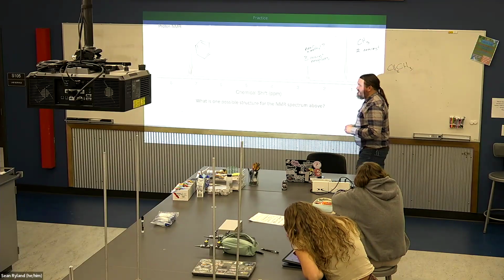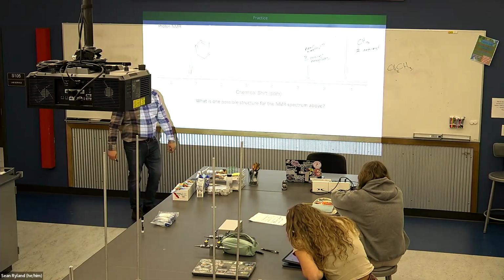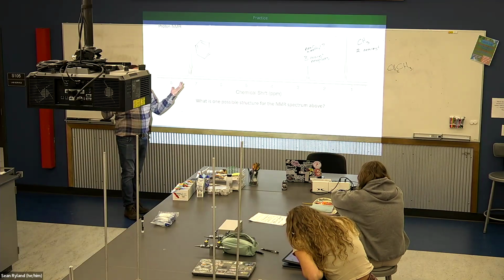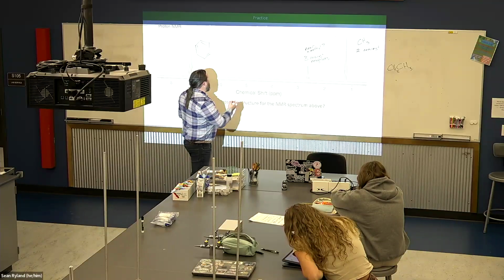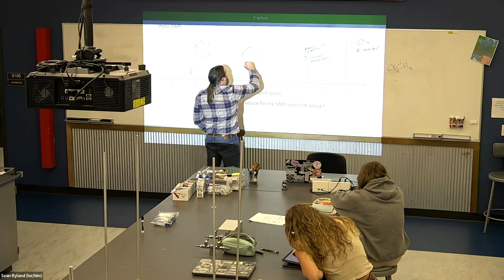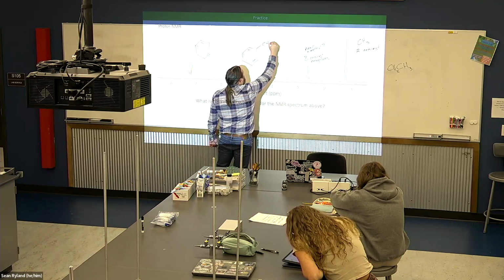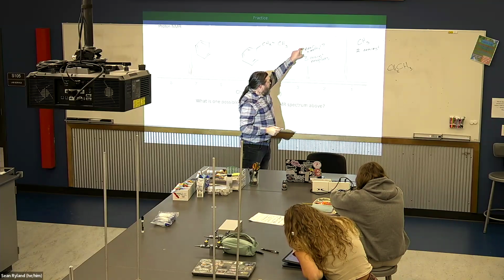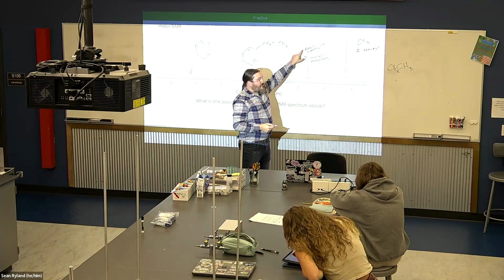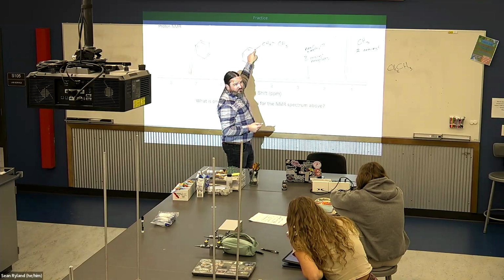Right, so you start to see some of these patterns. So if we know we've got an ethyl group and we know we've got a benzene ring, what's the most obvious structure we could draw? Benzene ring with an ethyl attached. And that is going to match. That makes this make sense then, right? Because this CH2 then doesn't have any other nearest neighbors.